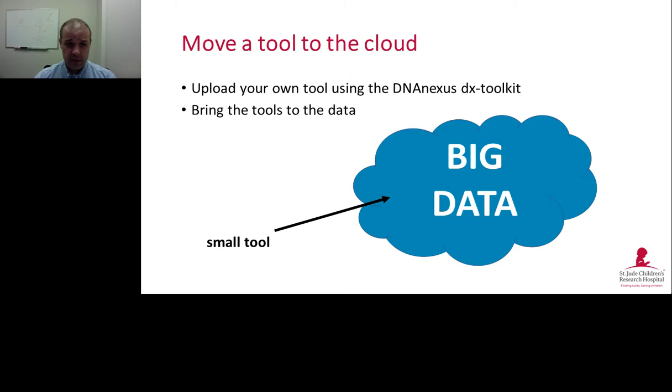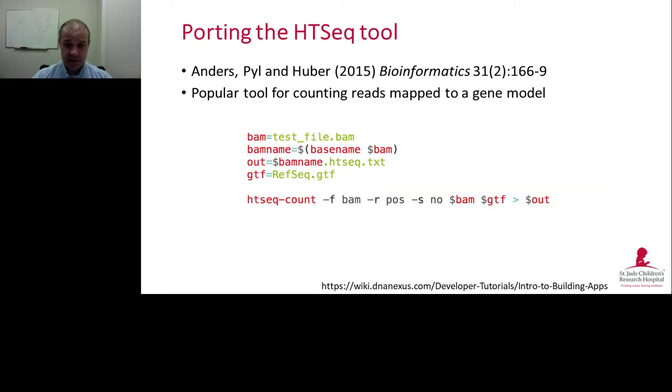The new mantra is becoming bring the tools to the data, because the data from whole genome sequencing is huge, whereas the tools are relatively small. And as I'll show you in the next couple of slides, it's actually quite easy to port your tool. I think a programmer of quite average abilities, such as myself, can quite easily do this.